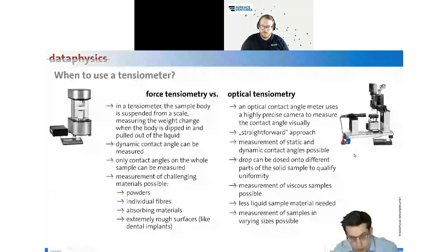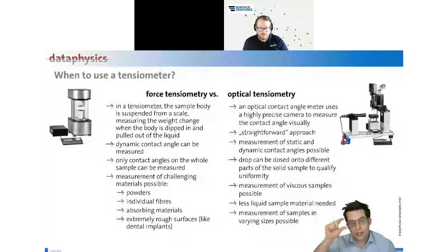And the optical contour analysis system, I think this is the more modern technology because, in order to do this, you needed to have good enough computers to automatically evaluate the shape of a drop. So these computer-assisted methods came up at the end of the 90s to be widely available as commercial units. These devices have some advantages because you only need very, very tiny sample volumes in these little syringes that you see in here.